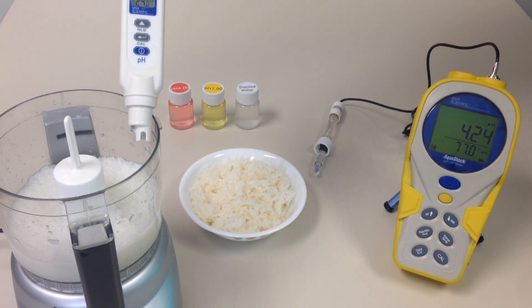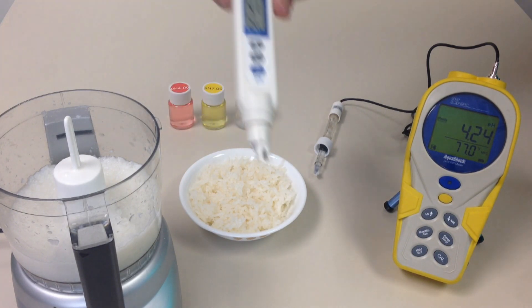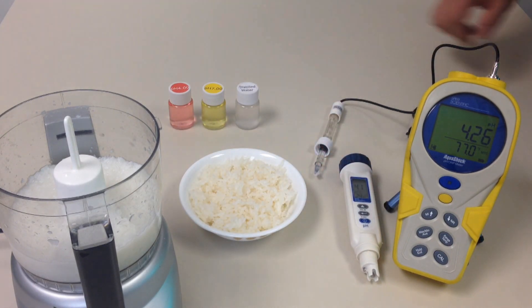So we have one batch where the amount of vinegar is correct and the other batch is incorrect. If you want more information about pH meters and how to use them, please go to speardirect.com where you can see our whole line of products.